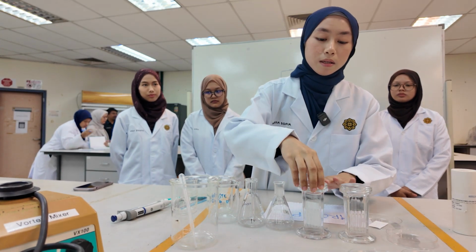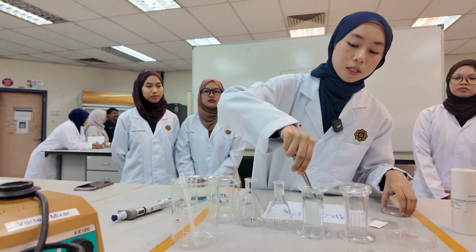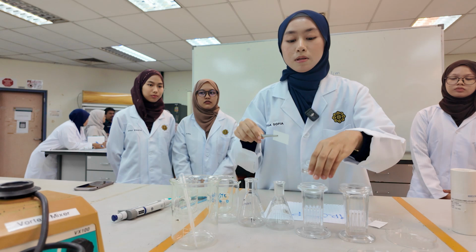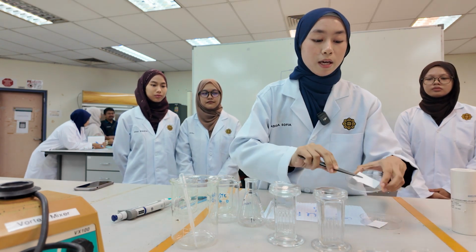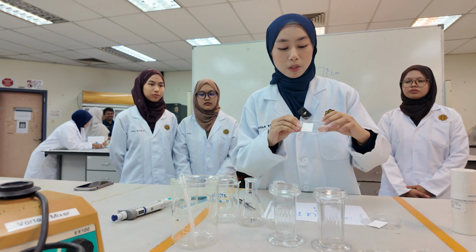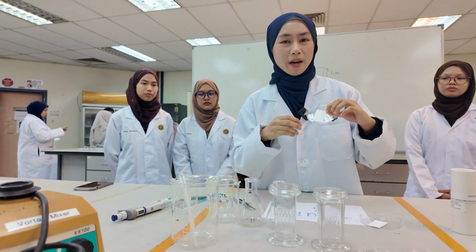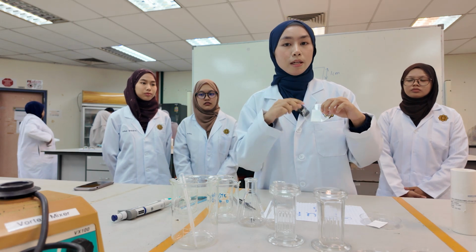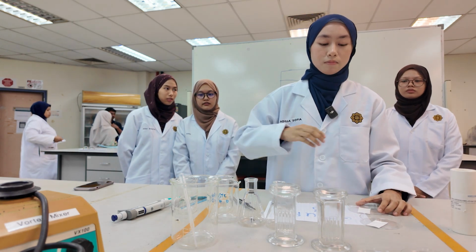Once it's done, gently take out the TLC plate. We cannot see the spots with our naked eye, so we need to use the UV light.